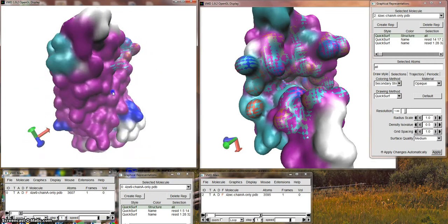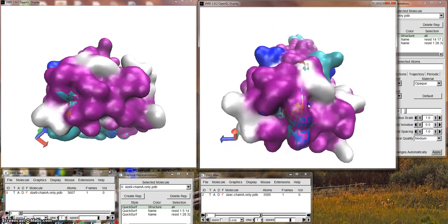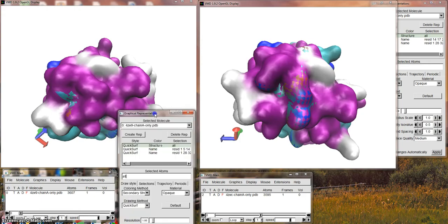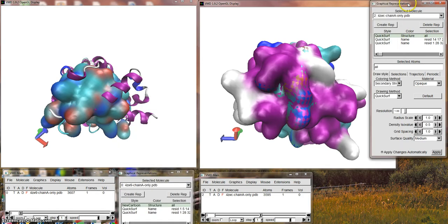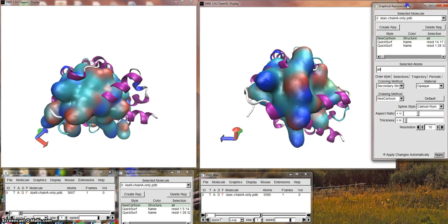So let's go to the bottom. What do we have coming out? That looks pretty well closed. Let's back them up. I need you to come up here and go back to new cartoon, and you to come here, back to new cartoon. Just leave that one active.